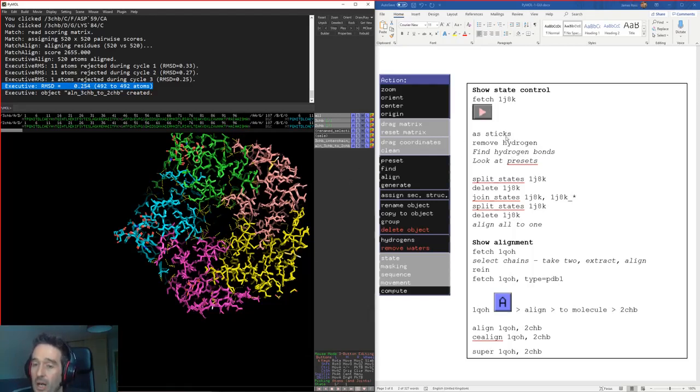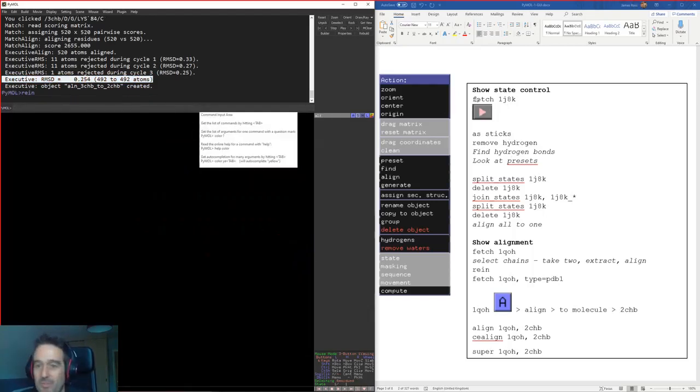I'm going to go through a few commands here to try and get back on script.